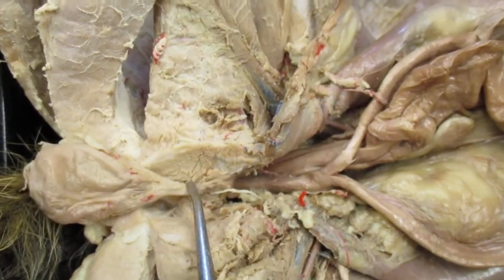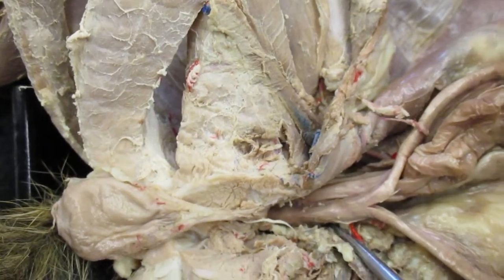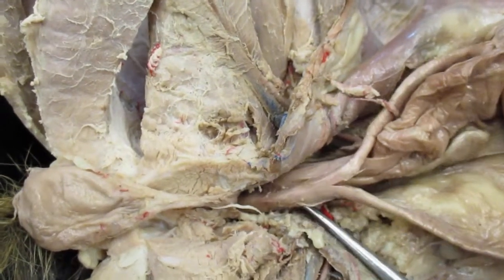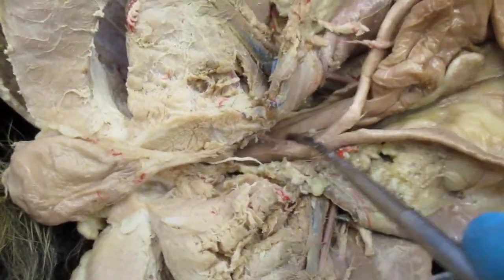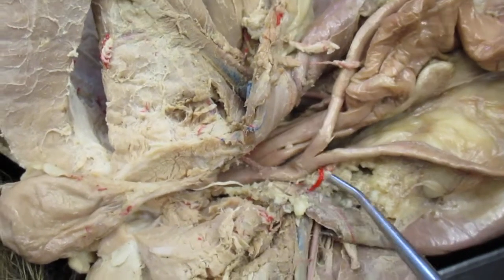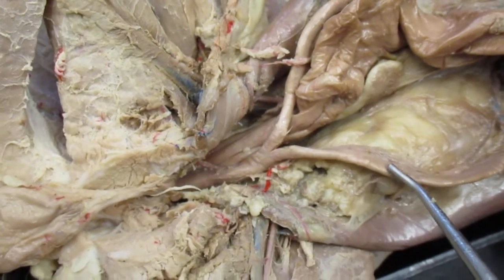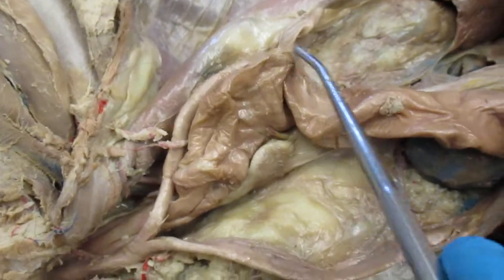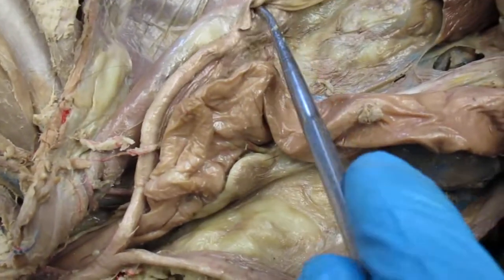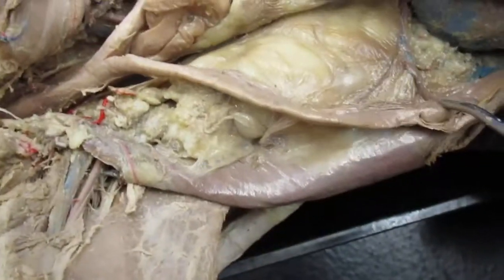Urethra, vagina is the next one. And then the rectum. And then the uterus, body of the uterus, uterine horn, ovary, and ovary.